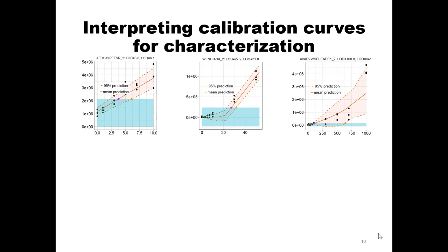The LOD and LOQ on the top of the figures, I will tell you in a little bit. It is MS Stats. MS Stats can do figures of merit now. But I'm not going to get too much into that because I don't want to spoil your MS Stats for later this week.